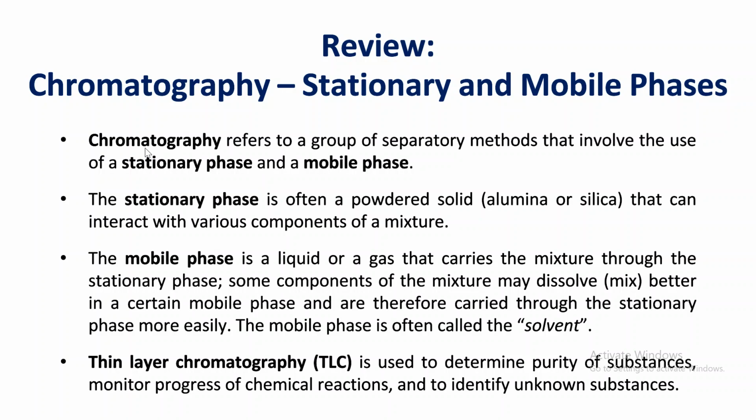So again, chromatography, the prefix chroma means color. So this refers to a group of separatory methods that involve the use of a stationary phase and a mobile phase that separates substances based on their color. Now, the stationary phase is often a powdered solid, alumina or silica, that can interact with various components of a mixture, as we did see last experiment, and we're going to see the stationary phase again in this experiment.